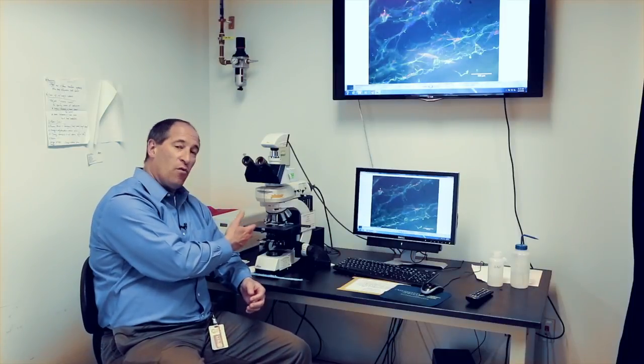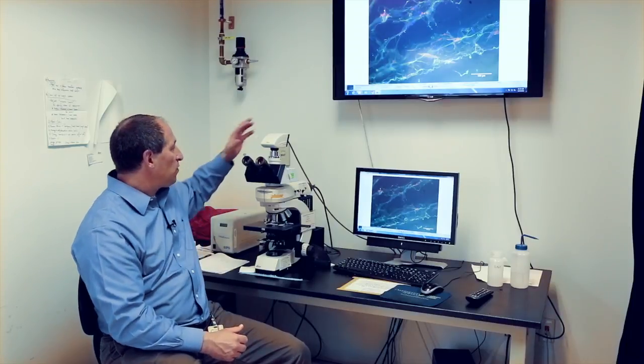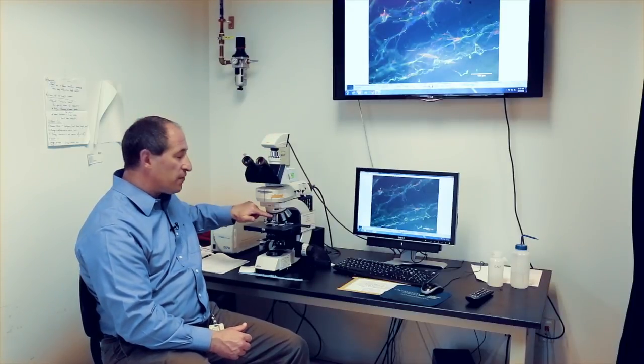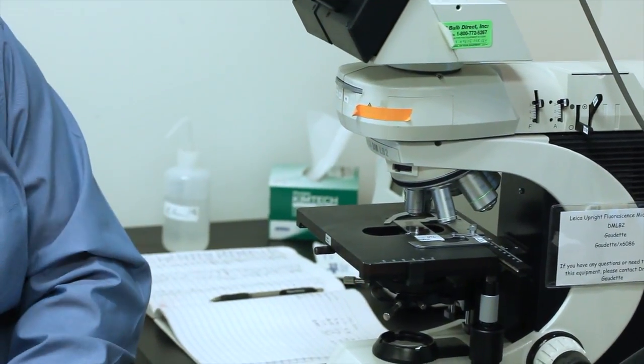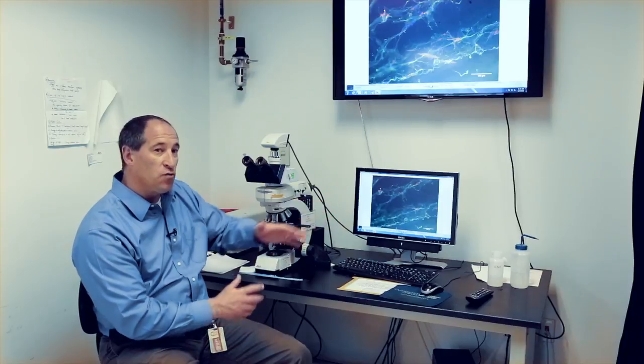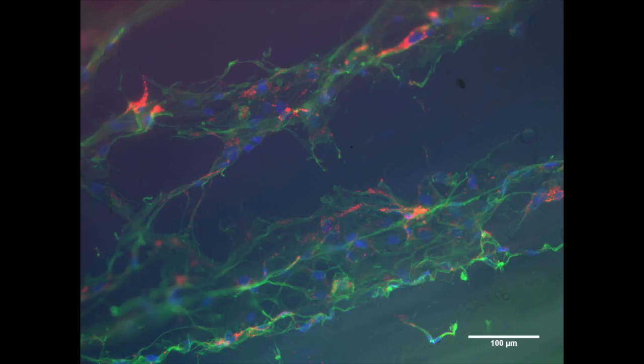After we've taken the tissue sections and stained them for different proteins like actinin, or looked at our quantum dot markers, we take them to the microscope. We take images with our camera system using different objectives—5x, 10x, or 20x. We image the green channel, red channel, and blue channel, then combine them together.